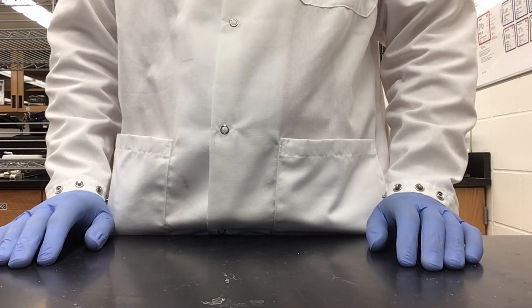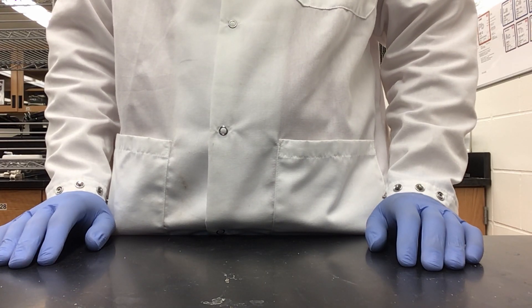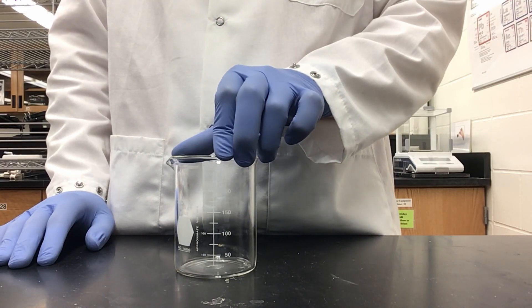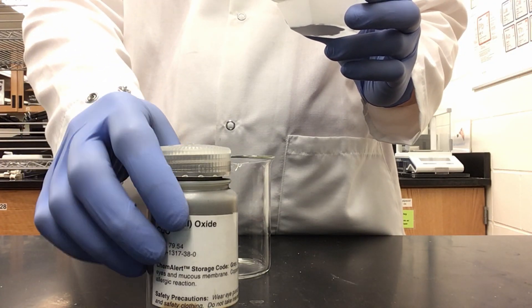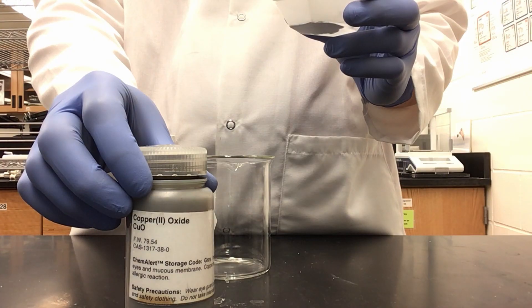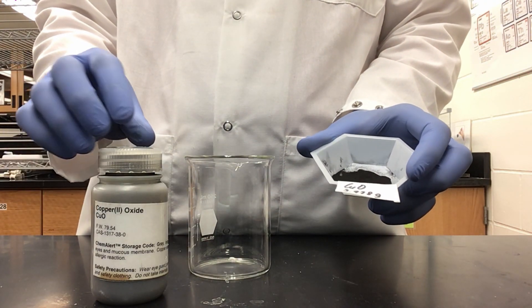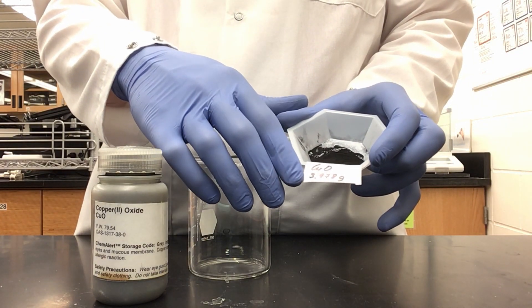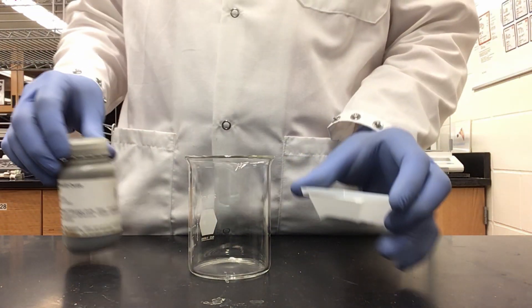We are moving on to Part 1 for preparation of salts — specifically preparation of copper sulfate. For this, I will need a 250 ml beaker. I have gone ahead and pre-weighed my copper oxide. You need to decide how many moles you are going to use and get the exact mass needed. I have chosen to use 0.05 moles, which means I need 3.978 grams, which I have here in my weigh boat.